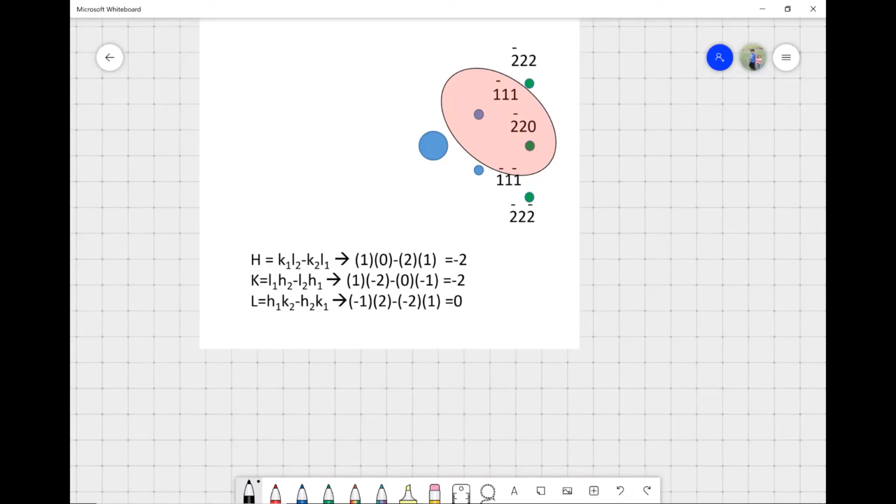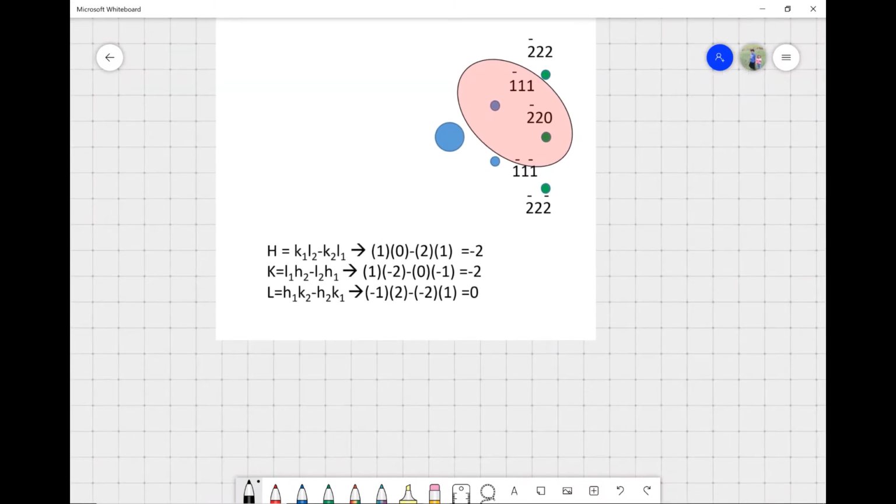All right, so zone axis now, and it's already worked out in front of us, but I was going to add some notations to clarify it. In this instance, I said this was 1, and this is 2.